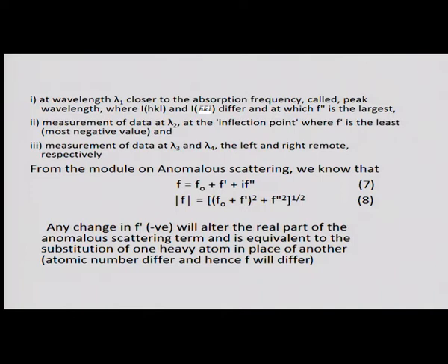Even though selenium is there, you are making selenium behave like another atom with a lesser number of electrons. 3 such atoms can be made physically, not chemically.